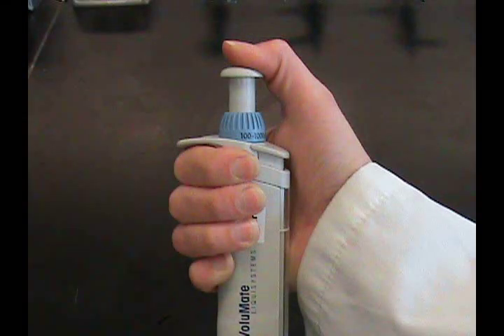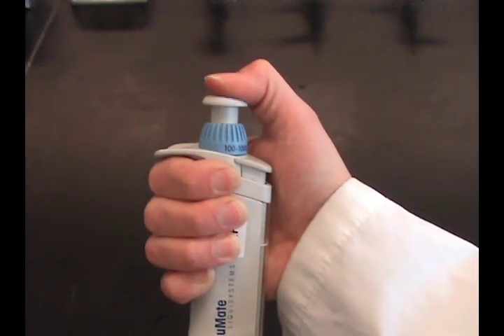Holding the pipette vertically, wrap your hand around the pipette. Allow your thumb to have control over the plunger button.